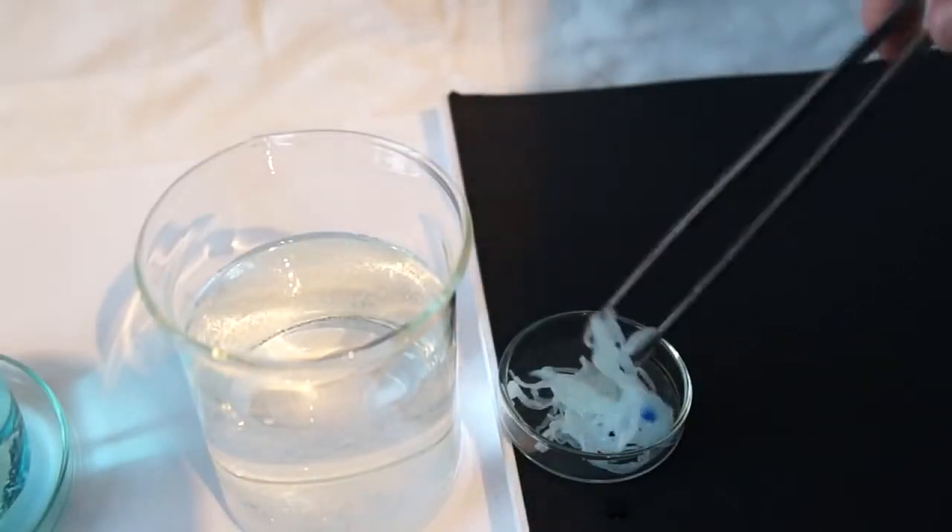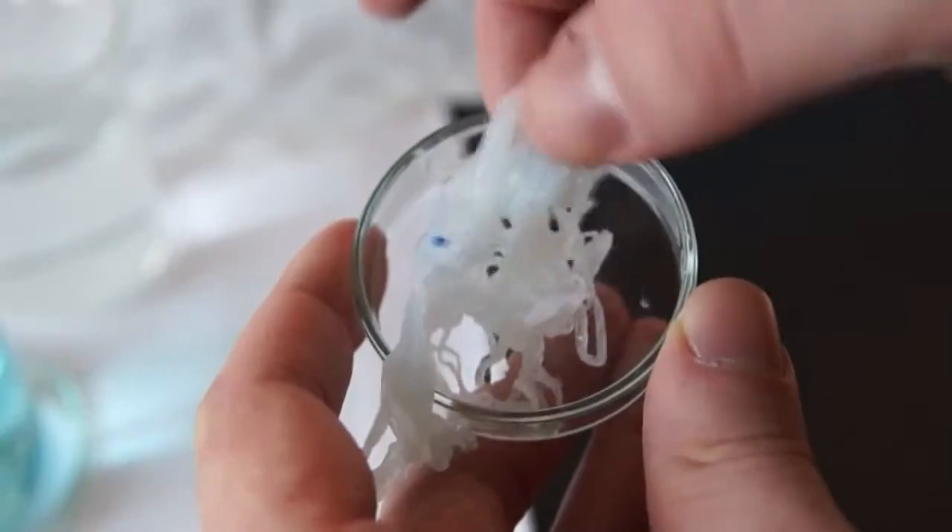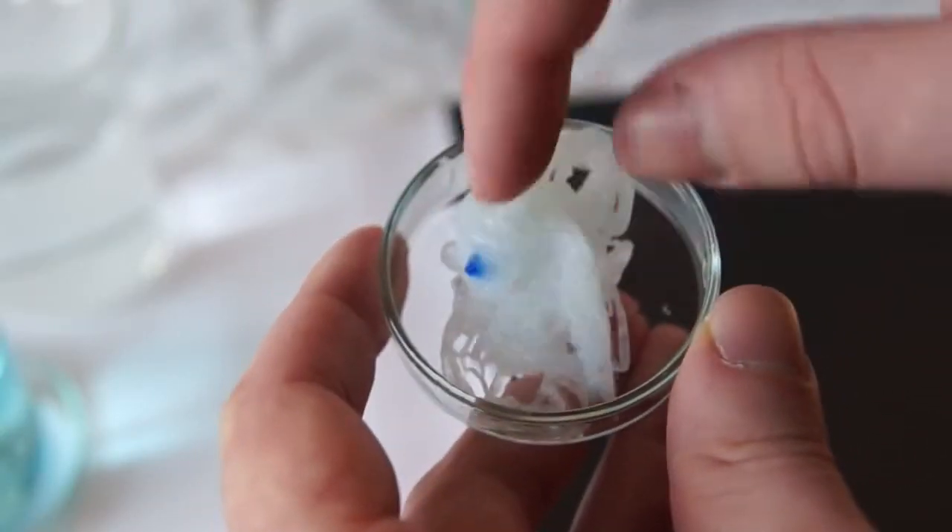Hello everyone! Today we will conduct a very interesting experiment which is called making rayon, or artificial silk production.